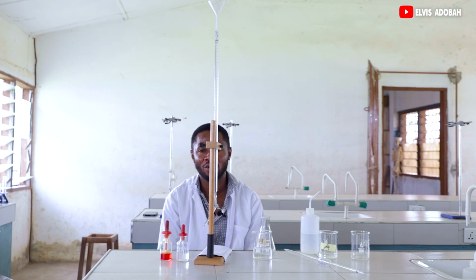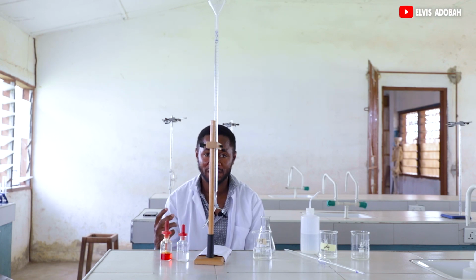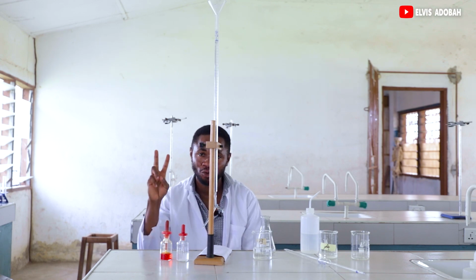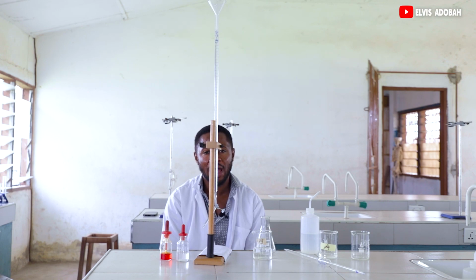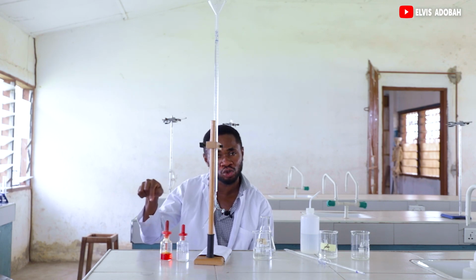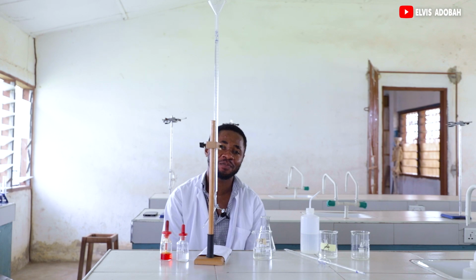We've already talked about continuous double indicator titration. We said for double indicator titration, one of the samples is made up of a mixture of two different substances, and we want to calculate the amount of each of those two substances present in the mixture.